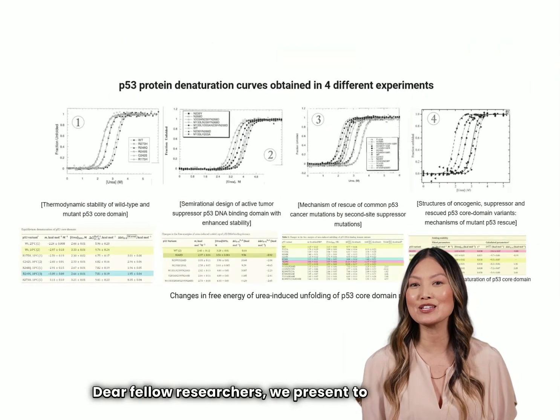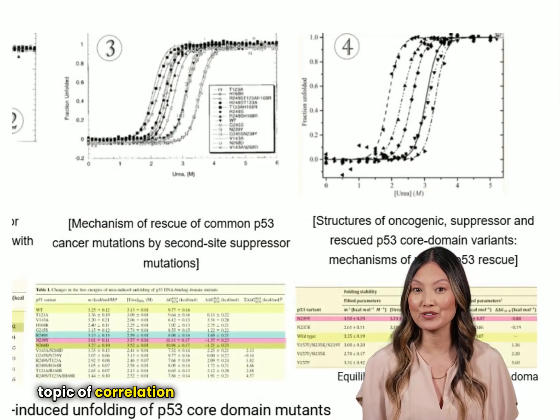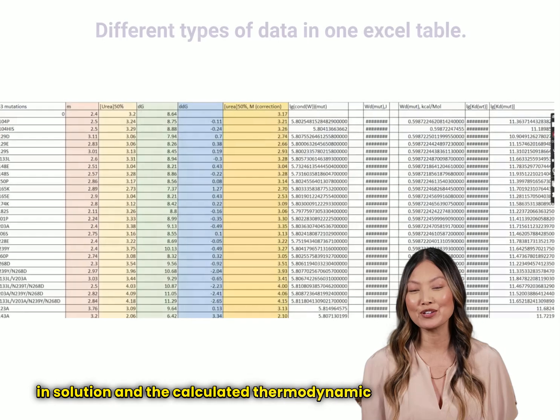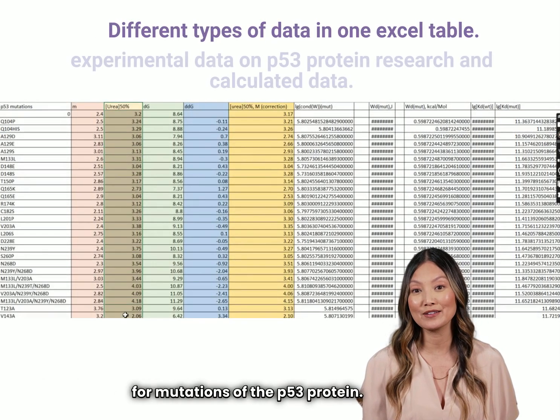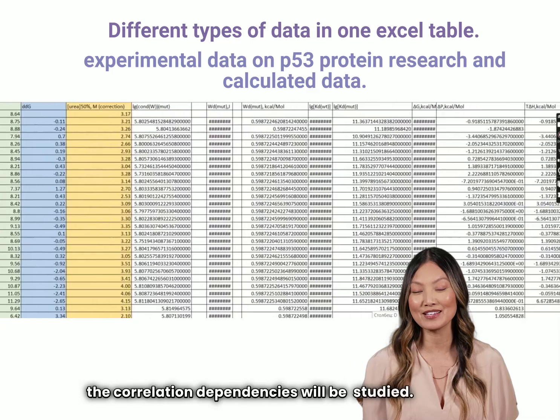Dear fellow researchers, we present to your attention a short video devoted to the topic of correlation between the denaturant concentration in solution and the calculated thermodynamic parameters for mutations in the p53 protein. Let's select the columns between which the correlation dependencies will be studied.